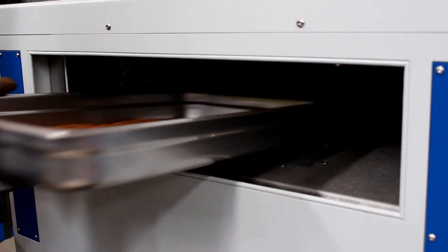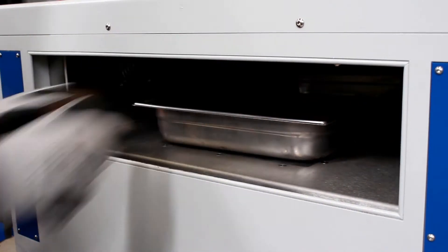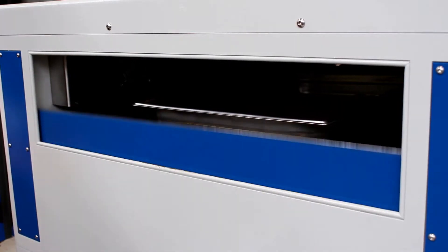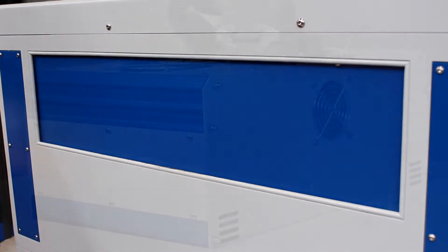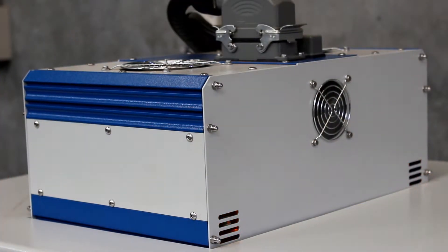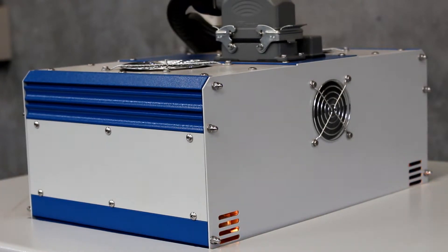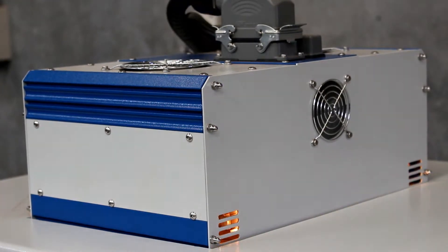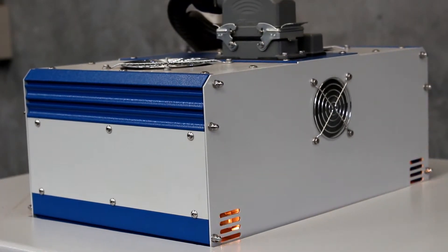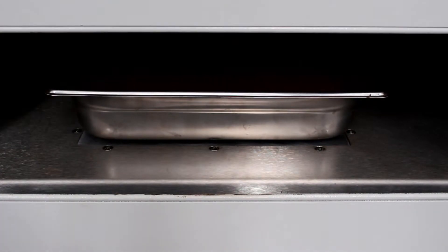The RD20 is capable of drying samples up to 8 kilos in a fast and efficient manner. The key to the ultra-fast drying times is the dual-action heating with powerful infrared lamps acting from above, combined with a hot plate heating from below the sample.